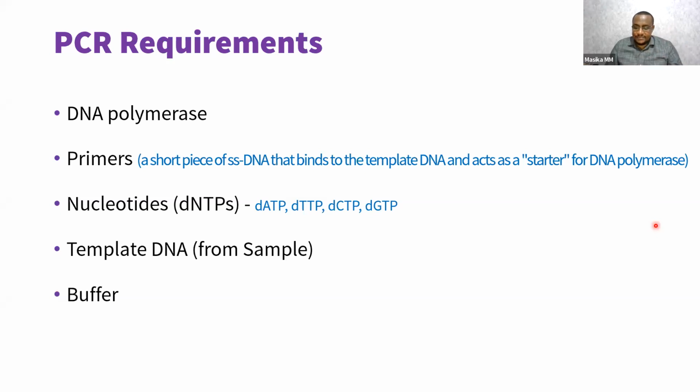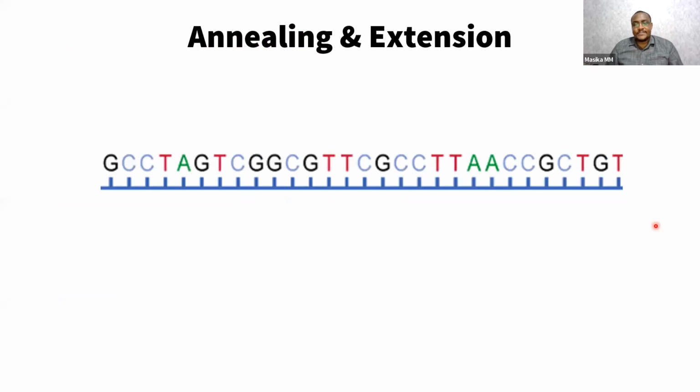Okay, the next thing I would like to illustrate is how these primers work, because really primers are what determine how good your PCR is, most of the time, in terms of detecting pathogens. And this here is a target genome running from, let's say, 3' on my left to 5'. So the primer will always attach from 5' to 3'. And if you notice, it's complementary. So a C to a G and an A to a T in that order. And because this is running from 3' to 5', the primer is now running from 5' to 3', because that's the direction that the polymerase will move.